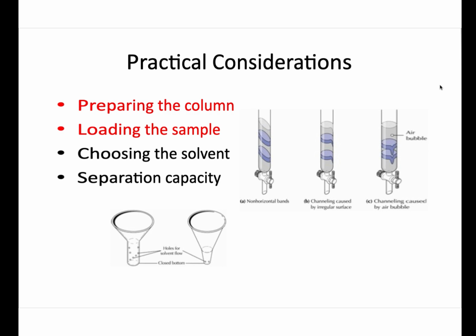How can you do that? Start with less polar solvent on the TLC plate. Then increase the polarity as long as you get a better separation. That means the distance between spot 1 and 2 on the TLC will be big. The bigger the distance, the better the separation of the components.